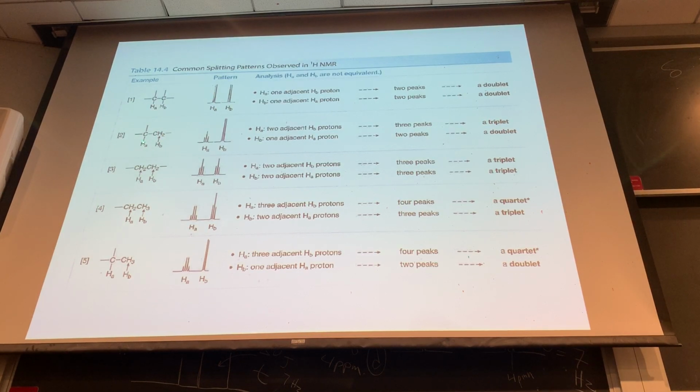And then we have a methylene and a methine, that will be a triplet doublet. And we have 2 methylenes, 2 triplets. So these patterns start to be repetitive. So you see different patterns, you can tell what type of substructure might be in your molecule.